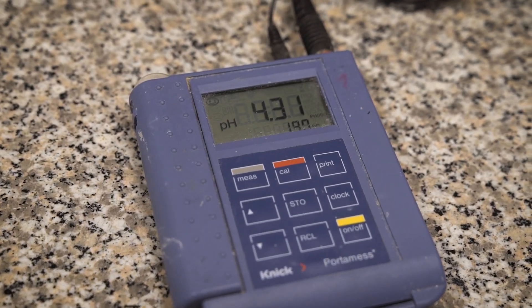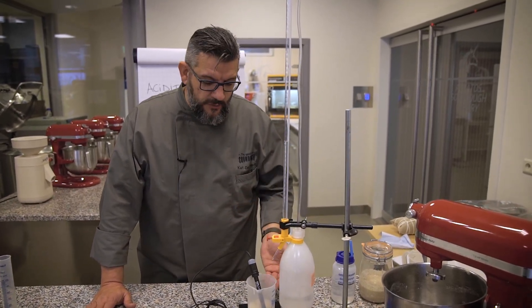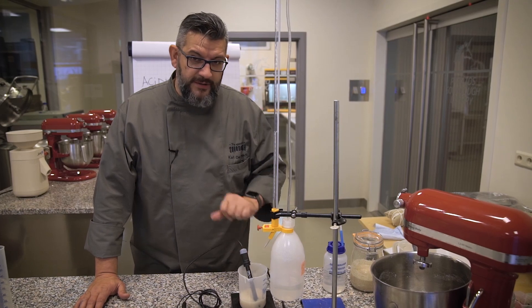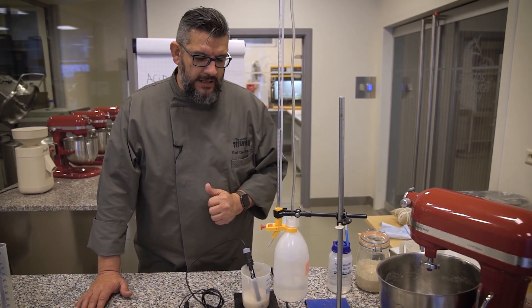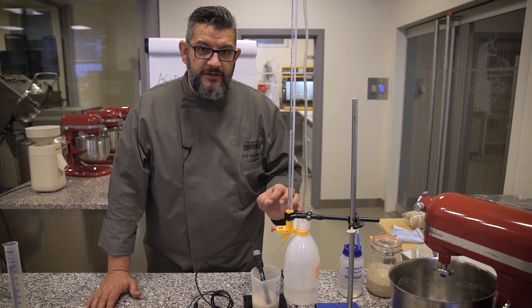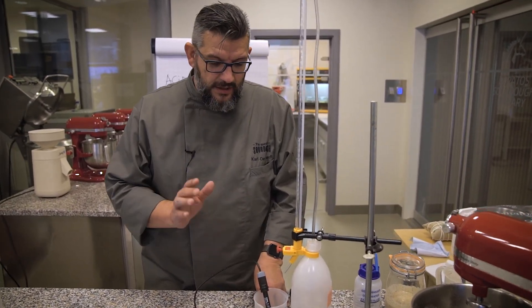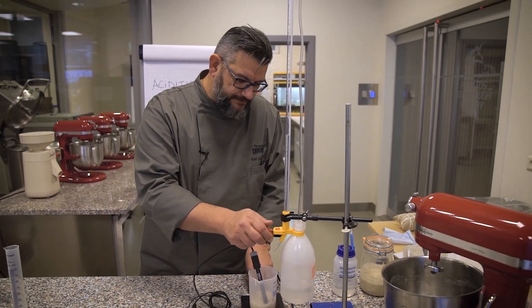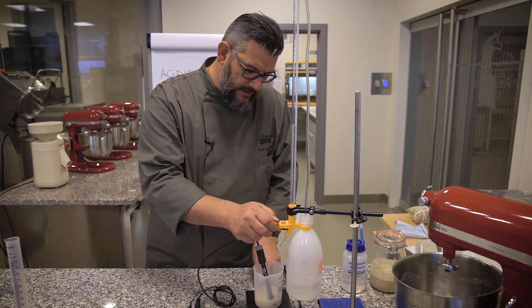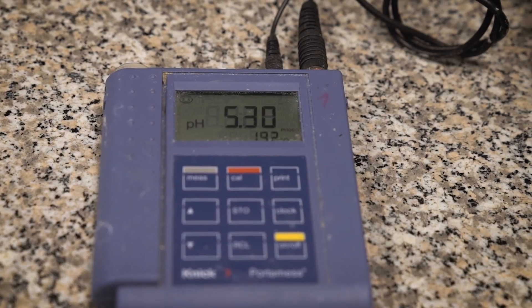The actual pH of this solution is 4.31. What we are going to do now is to add, little by little, droplet by droplet, the sodium hydroxide. This is very high in pH, so it will bring up the pH little by little of our solution. The scientist who invented this measuring system defined that we need to increase the pH until 8.4 — that is the standard used to measure the acidity. I'm going to open the valve and you will see that little by little the droplets are going to fall and the pH will gradually increase.